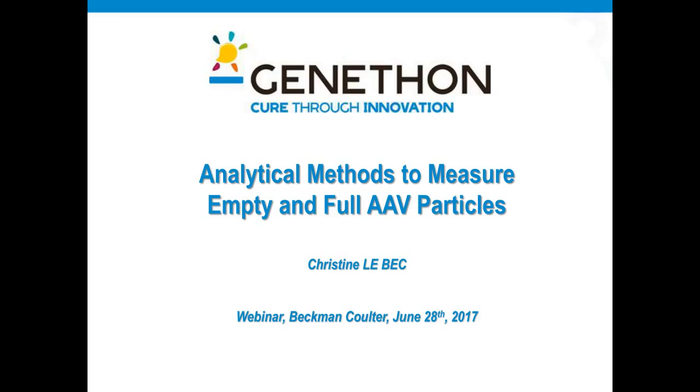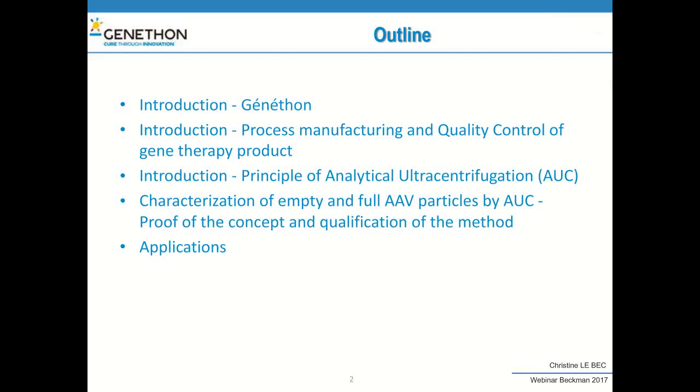Thank you, Julie, for this introduction and for giving the opportunity to present our development regarding the analytical ultracentrifugation technology for AAV vectors. First of all, I would like to show you the different parts of the presentation. I will make an introduction of Genethon.